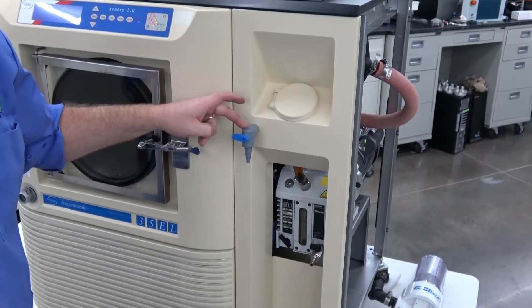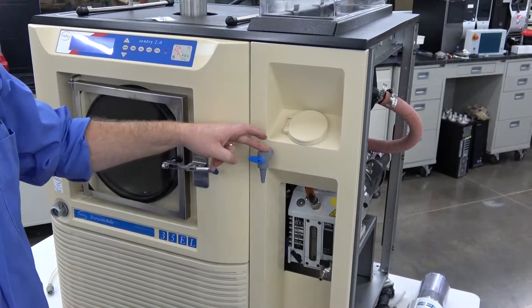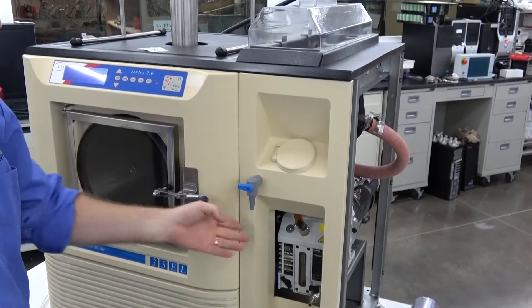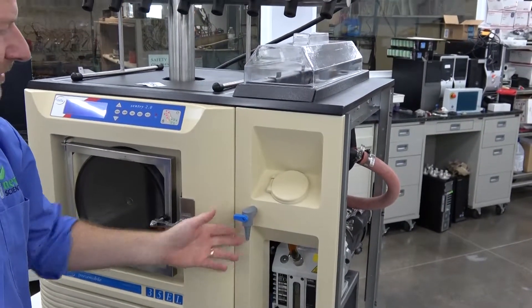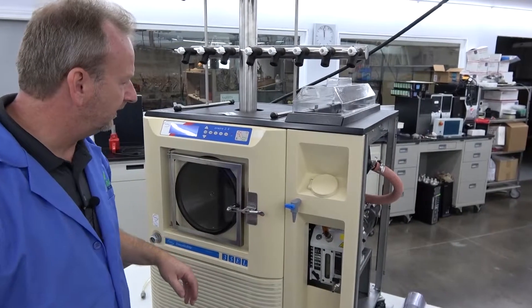We also actually installed a drain valve up front here, which isn't standard on these machines, but it makes it really nice to be able to drain your water bath right up front. Sometimes you have to go back in the back and do it, but this made it nice and convenient here.